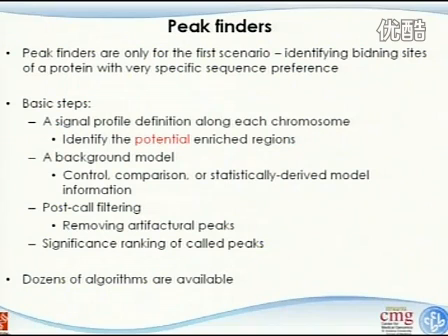And another thing, good or bad, is that so far there are dozens of algorithms available. So in this lecture, I'm not going to tell you any one of those specific algorithms, how they work, and it's not the purpose of this. Instead, I'm going to give you a summary of the general steps that people are following. So some of the parts may be applied to one algorithm, some others may be picked from other algorithms.